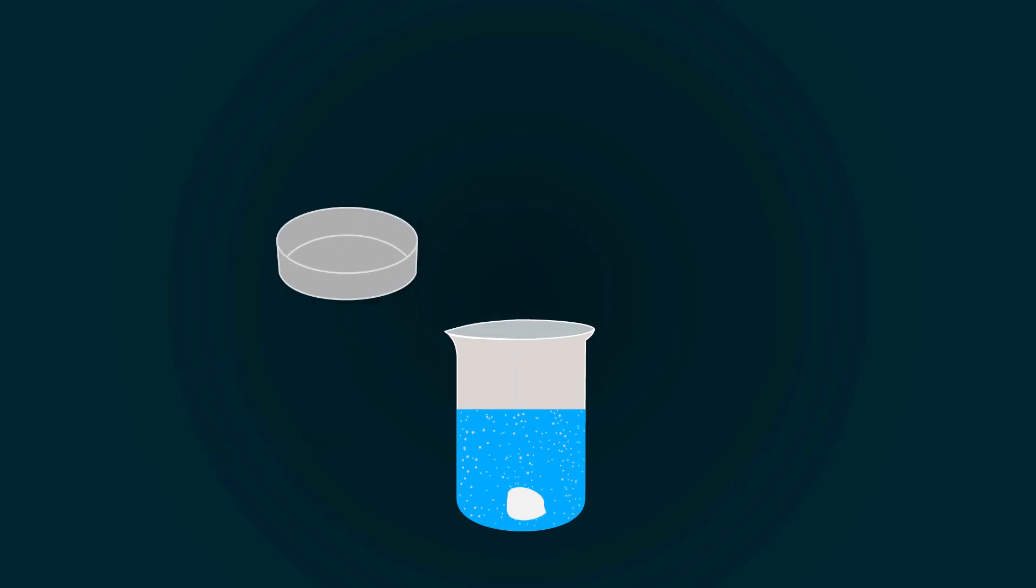In this video, we will learn how to prepare 5% solution of potassium hydroxide.